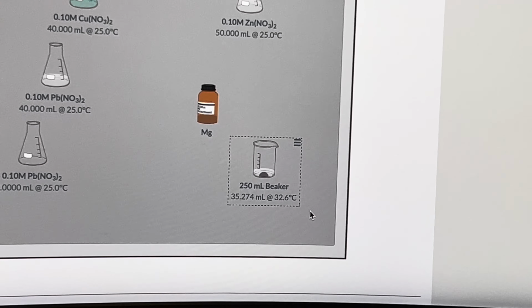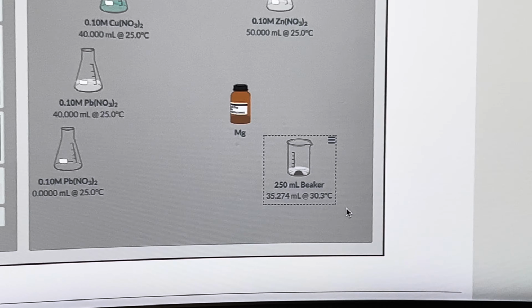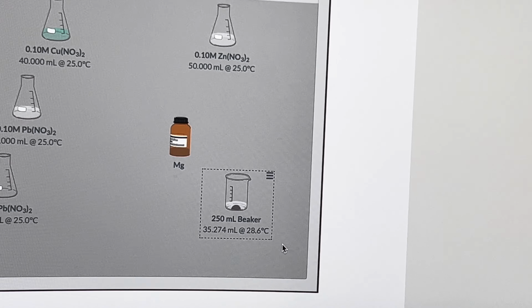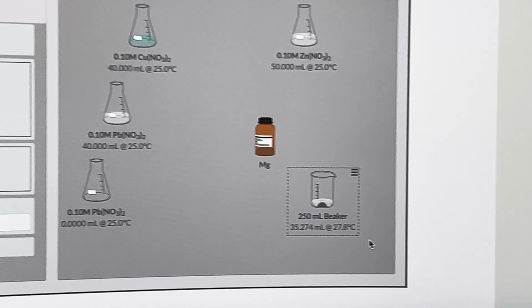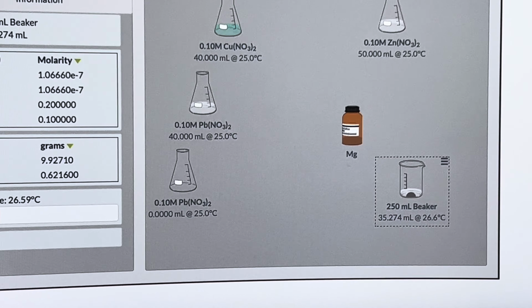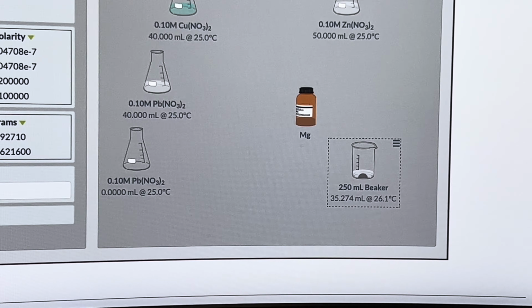Now, as you can see, we can observe that there have been temperature changes and pH level changes. However, I do not really see any changes with the solution color, but I do see changes of the metal as it turned lighter in color. And because of these observational changes we can see during the reaction, the reaction does occur. Therefore, magnesium reacts with all other metals, making it the strongest reducing agent.